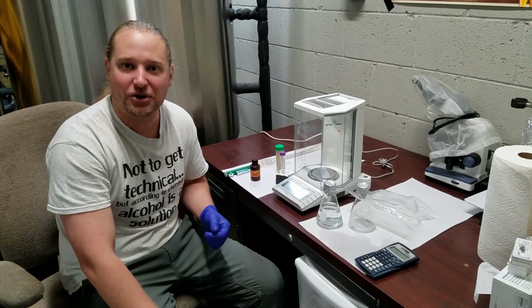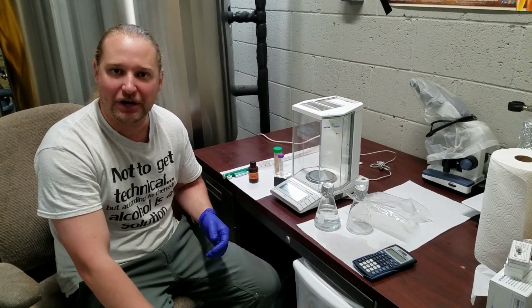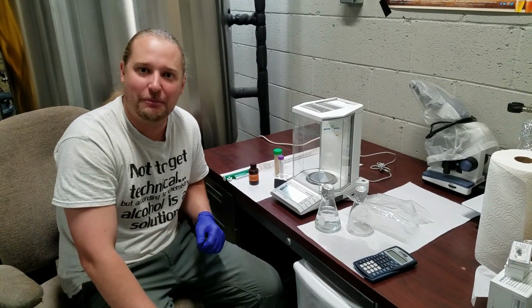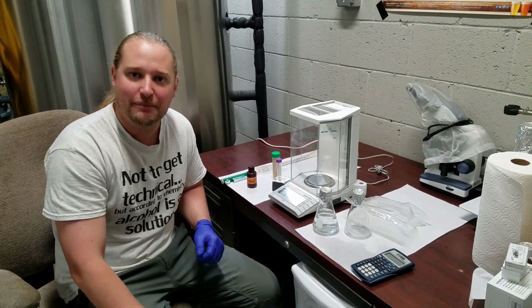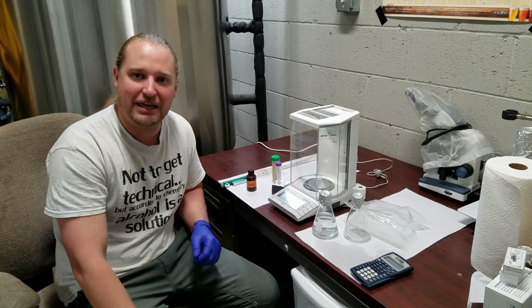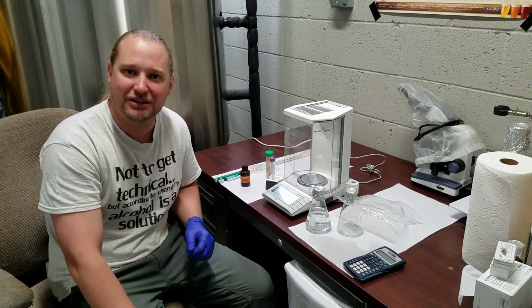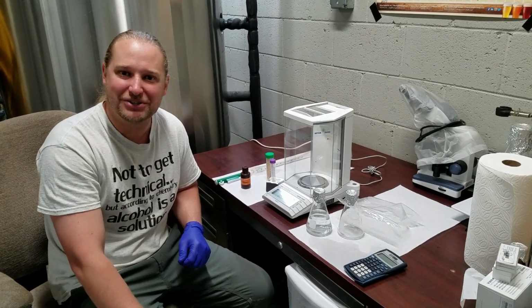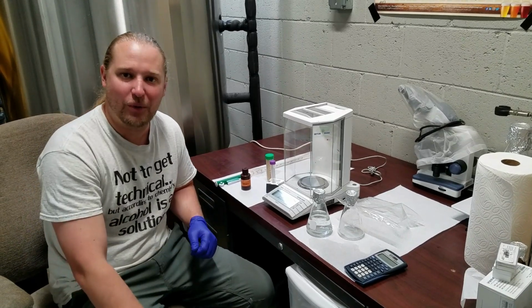If any of you guys are far enough in your brewing career and doing yeast dilutions, it'd be awesome if you could try it this way compared to your old way. Maybe do it a few different times with the slurry and see which way gives you more precise results. I'd love to hear your feedback in the comments below. So let's do the yeast dilution by weight now.